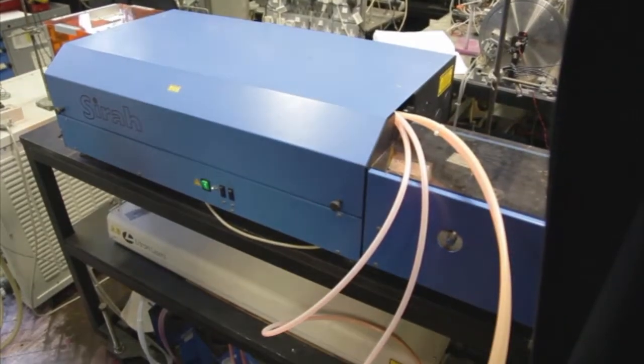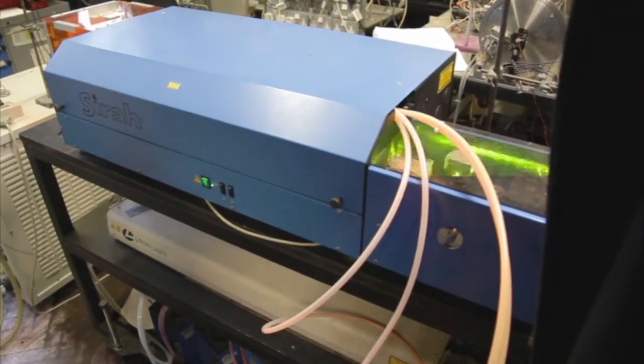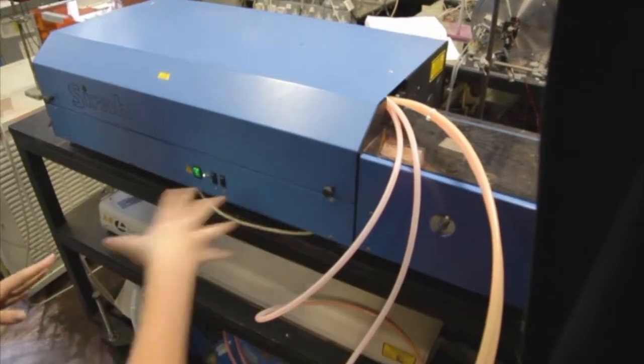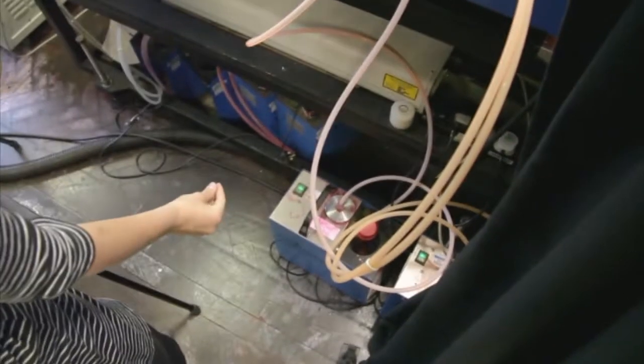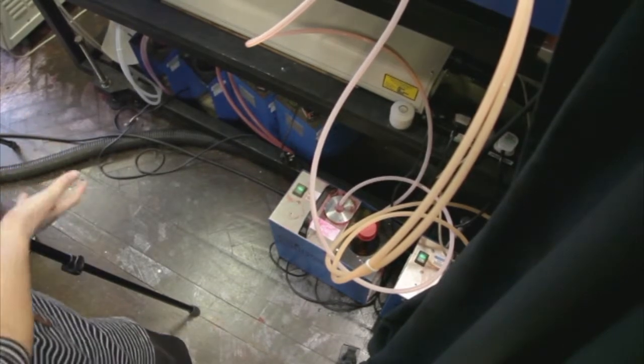So the dye that we're using in this case is rhodamine 6G, which is in a methanol mixture, and that's circulated around through these tubes through the dye laser itself. But the reason that a dye laser is quite good is you can easily change the dye and probe a number of radical species, so it's quite a flexible laser.